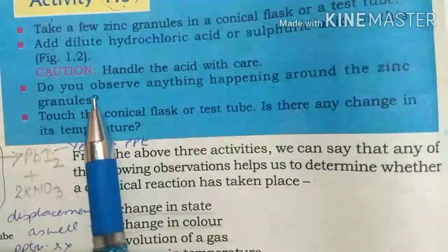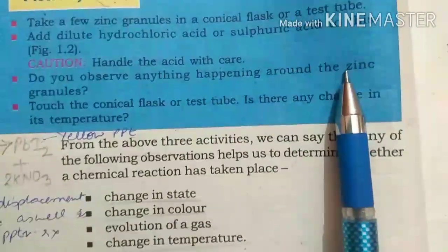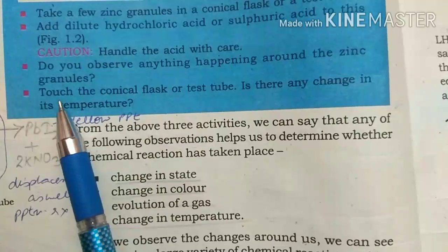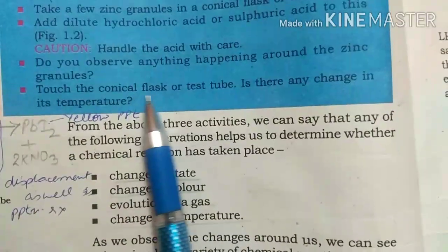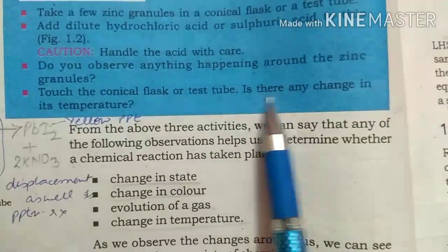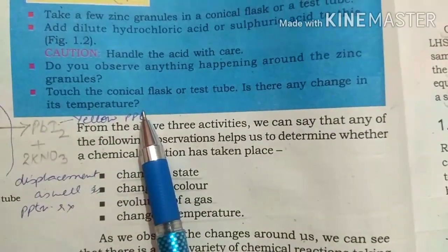Now we come back to chapter number 1. They were asking that what do you observe? So we have checked that hydrogen gas is produced. Next step, touch the conical flask or test tube, whichever we were using. Is there any change in its temperature?